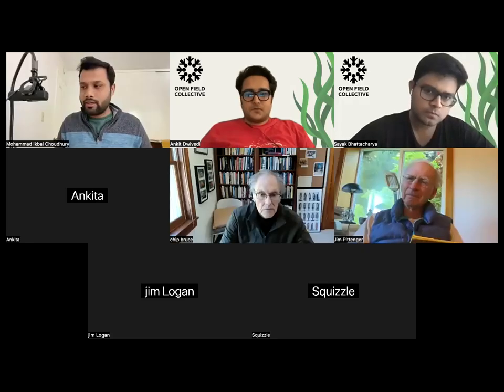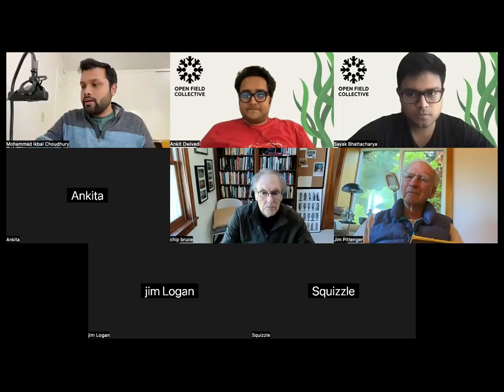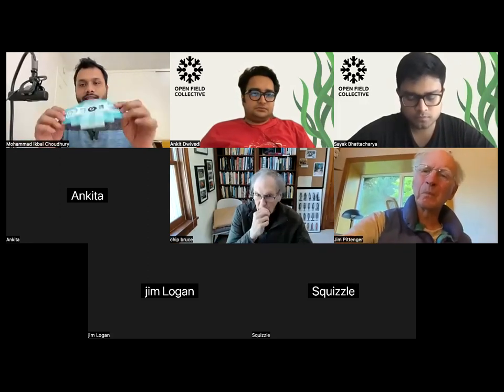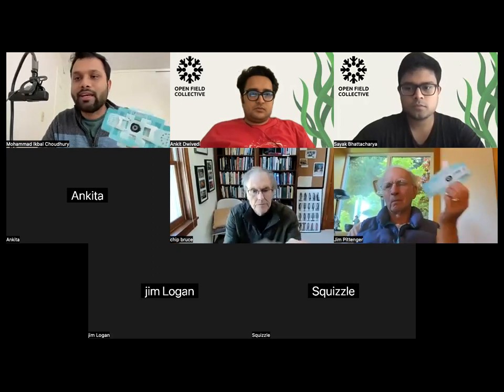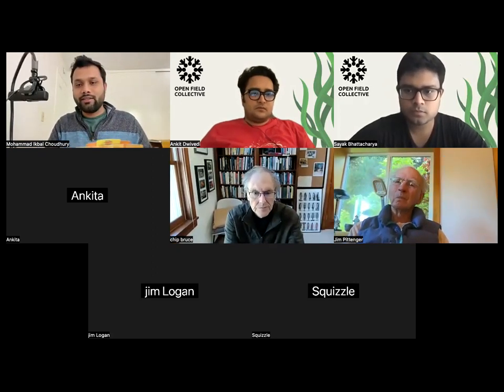as an instrument. Just accept that. Okay. So foldscope as a tool looks like that. You all have received it. You have it in front of you. It would be great if you can. Yeah, perfect. Okay, so if you have it in front of you, we will all practically do this demo.